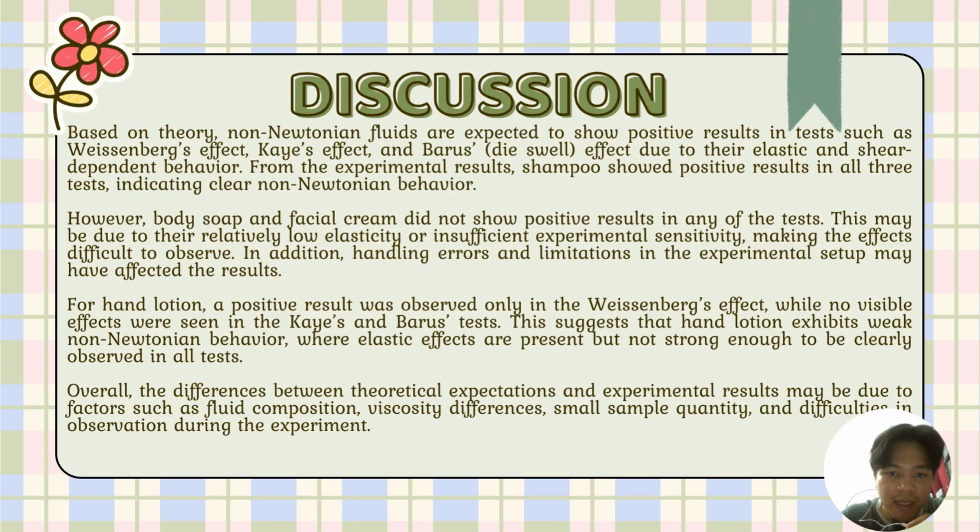In addition, handling errors and limitations in the experimental setup may have affected the result. For hand lotion, a positive result was observed only in Weissenberg effect, while no visible effect was seen in the Kaye's or Barus effect. This suggests that hand lotion exhibits weak non-Newtonian behavior where elastic effects are present but not strong enough to be clearly observed in all tests. Overall, the differences between theoretical expectation and experimental result may be due to factors such as fluid composition, viscosity differences, small sample quantity, and difficulties in observation during the experiment.